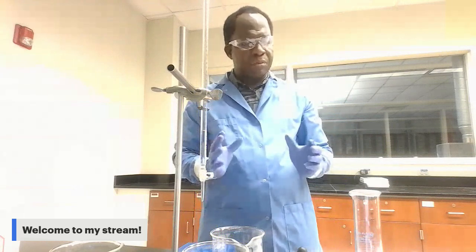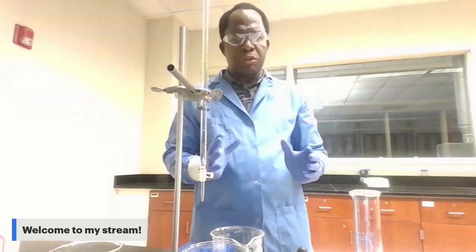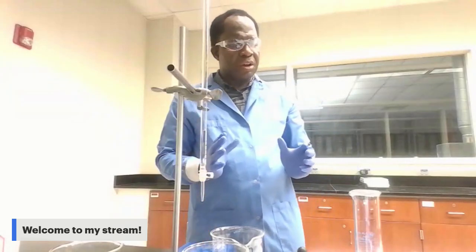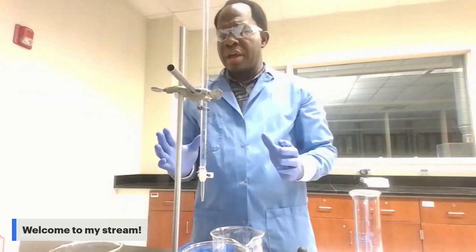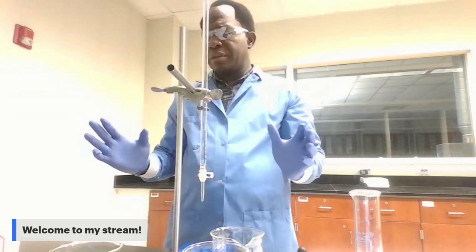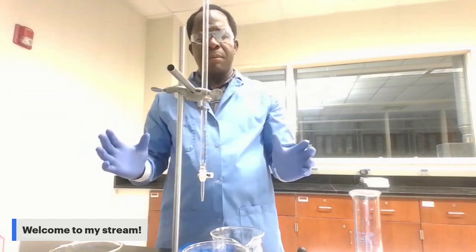And from there, you can also calculate the solubility product, Ksp, of calcium hydroxide. So then you're done for this titration process. You are at the end of the procedure of this lab.